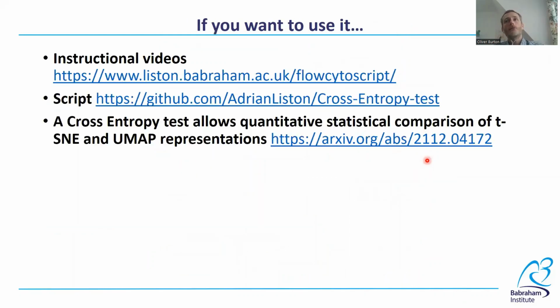If you'd like to use the test in your research, and we hope you do, we provided resources online. In addition to the paper and the R script, for both flow and single-cell RNA sequencing analysis, you'll find some instructional videos on our website. These are aimed at users who have little to no experience with R programming.